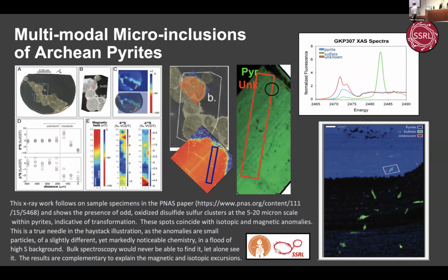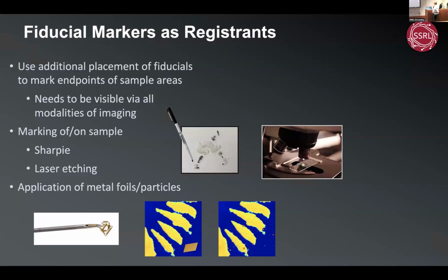But it was one of these things where I had the samples, they were the same samples, but we're kind of like in PowerPoint and Photoshop, turning the data sets and trying to see where exactly was that point, how did it line up? And we eventually convinced ourselves we could find the same cross sections in there roughly, and that maybe things kind of agree, but it's really not the way you want to do things, right? And so this really began to make us think about how we can actually do multimodal work well, and combine things like isotopes with X-ray chemistry.